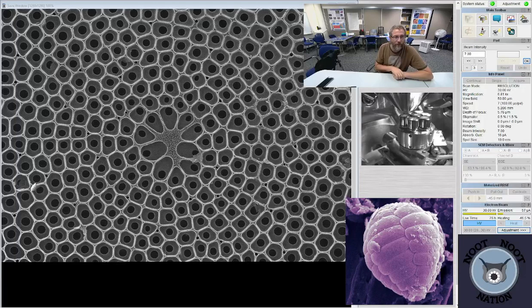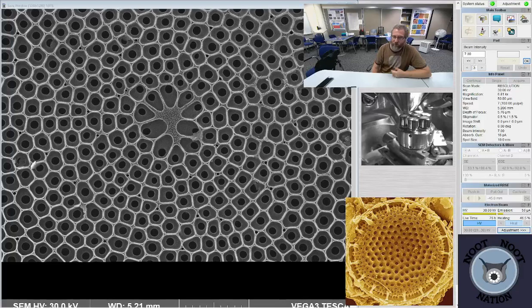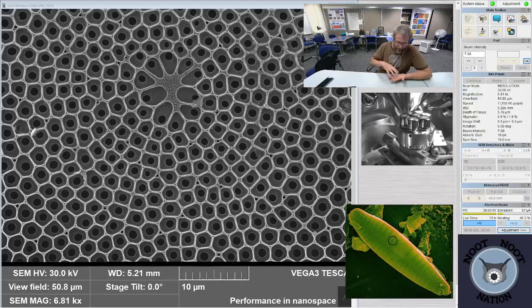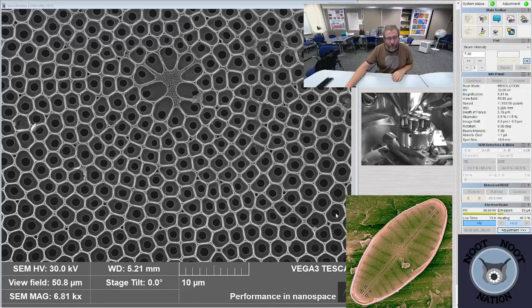They would have their chloroplasts, and I think for most diatoms, their chloroplasts are sort of associated with the areolae somewhat closely, but that's not always the case. So why they have that structure, I really don't know. I think the ultrastructure is sort of determined by the rigidity or the integrity of the skeleton. So it's to provide structure for the cell wall to have strength so that they can get buffeted or bumped by things.